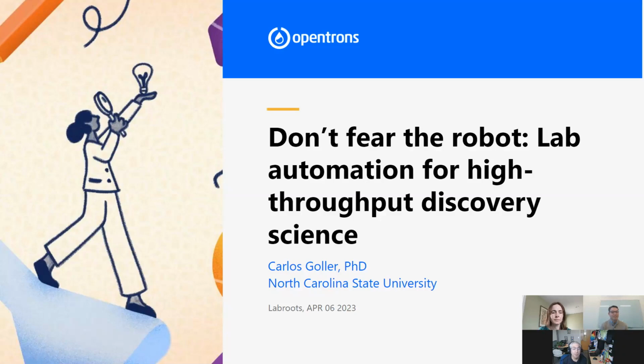I think that was a really good way to get some confidence that you can run something on this instrument. It's visiting a website and sharing a script with the robot. And then the protocol designer gets more into the design of the experiment without having that programming.